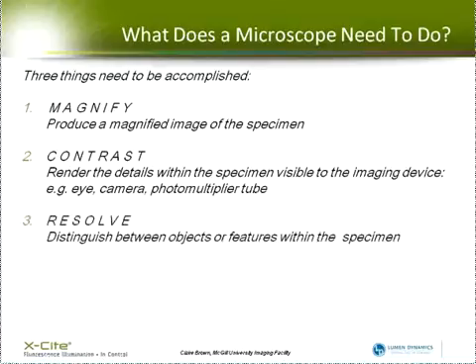And then you have to be able to resolve the features you need to see. You may just need to be able to resolve how many cells do I have, or you may have a higher resolution application where you might need to say how many vesicles are within my cell, or what's the substructure of the mitochondria within my cell.